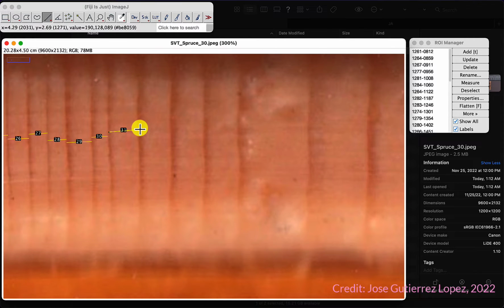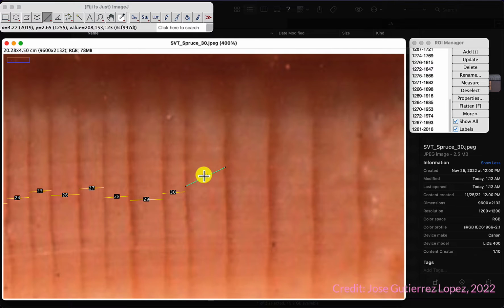No, that's a little crooked. Well, good that happened. What happens if you accidentally have a crooked line? It happens to me sometimes. I'm distracted and then this thing moves. Well, it's really easy. Just go back, select, and once it turns, is that blue or magenta? What color is it? I don't know. Green? I cannot see. Well, once you see that it changes color, that's the time when you can move either end of the line. In this case, I guess we want to correct it here. And perfect. Then we continue.